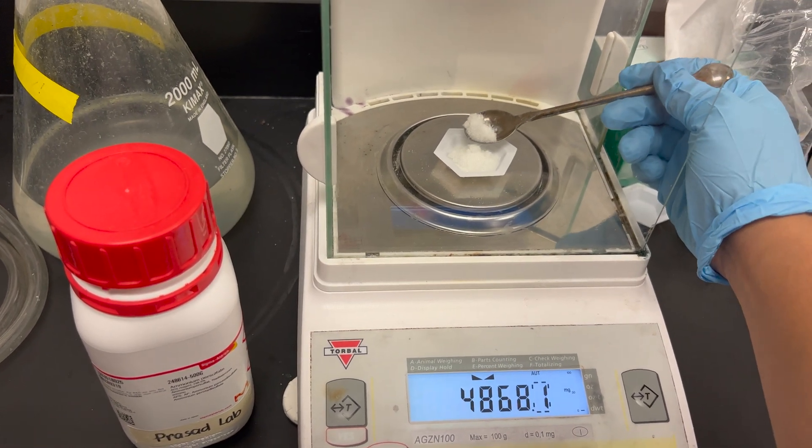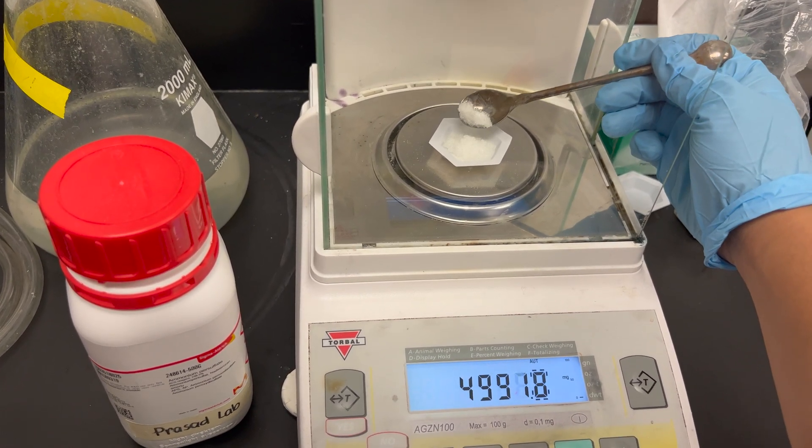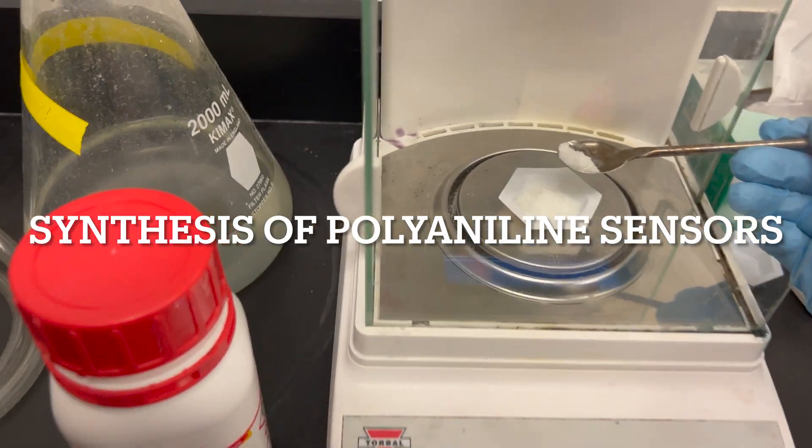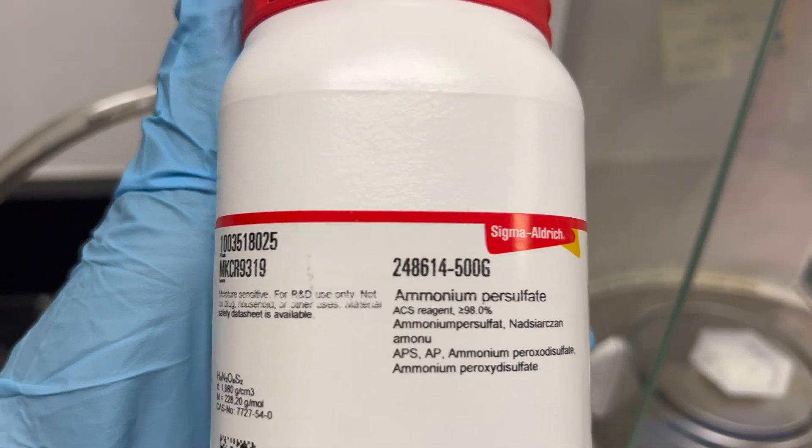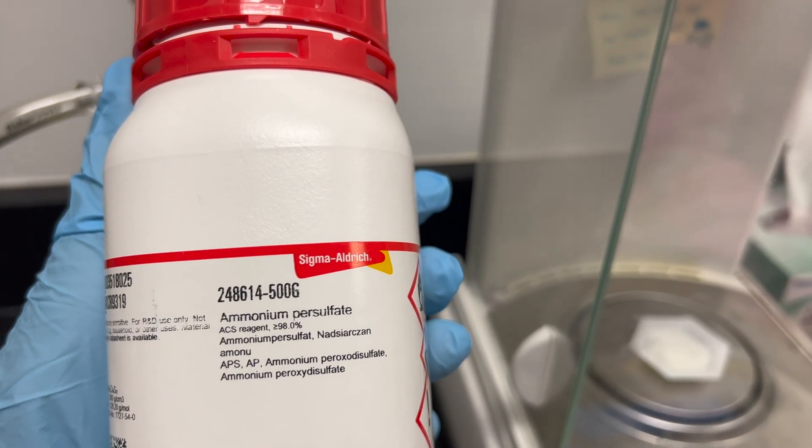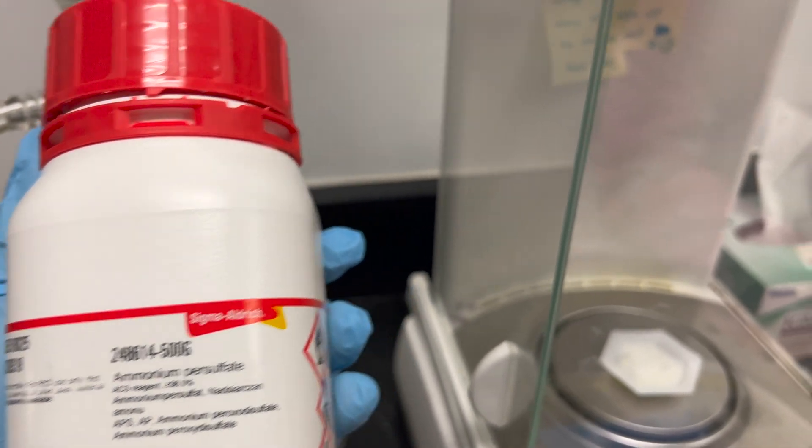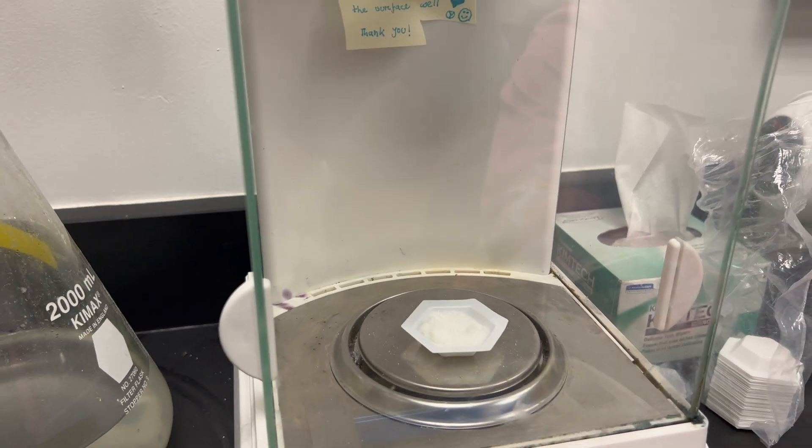Hello everyone, welcome to the Prasad lab. Today we're going to be synthesizing polyaniline sensors. We began by measuring 5 grams of ammonium persulfate, which we are going to mix with 50 milliliters of distilled water.